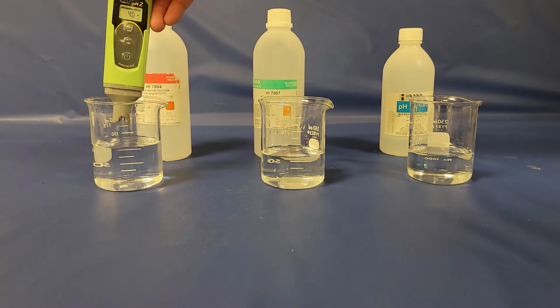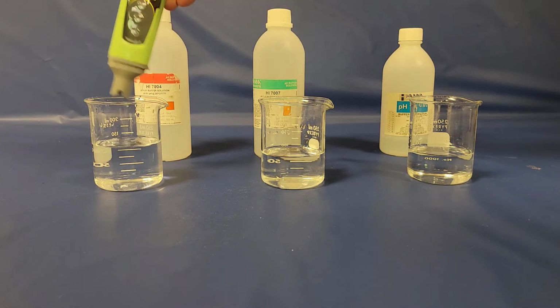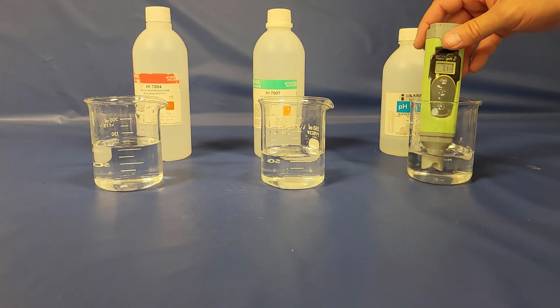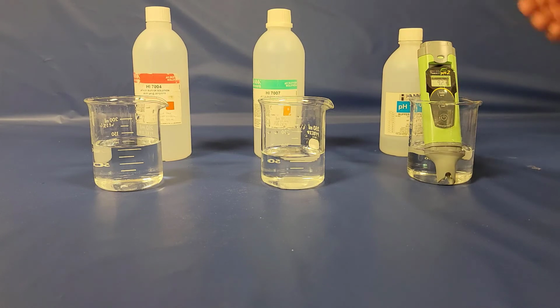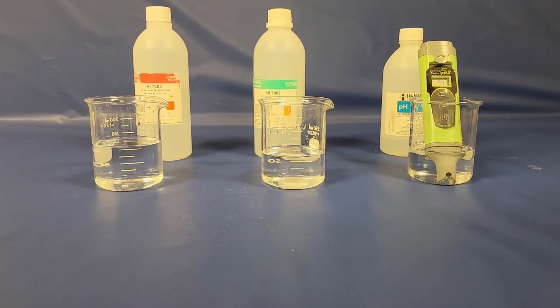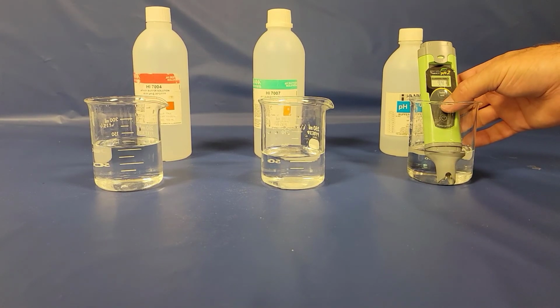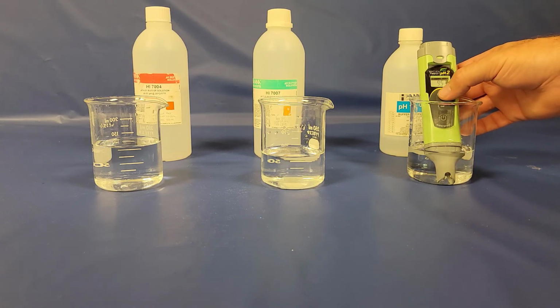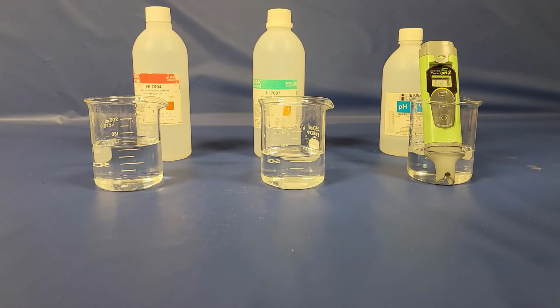So we'll pull that out, again, shake it off here. Okay, bring it over to 10, mix it around in the 10. All right, so it's reading a little lower than 10 here, so we'll go ahead and calibrate to 10 as well. So I'm going to hit calibrate. It says you want to calibrate to 10, right? It's close to 10 there. I say yes. So I hit enter, and it calibrates it to 10.